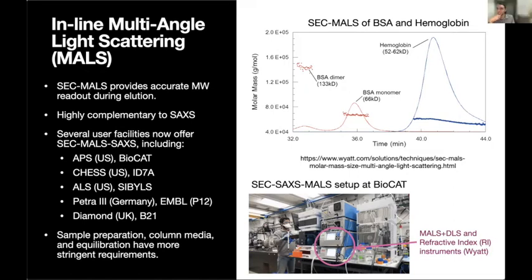Yeah, that's interesting. I know there are beamline scientists around. I'm supposed to not say it loud and clear, but it seems it works, especially running BSA for each user. Yeah, that's interesting. BSA is at a high concentration, and so they really produce this protective film on the surface of the capillary. That's an interesting observation. I know that people who do single molecule FRET will often use BSA to passivate their cover slips. I think it must be a similar mechanism. It's highly charged.